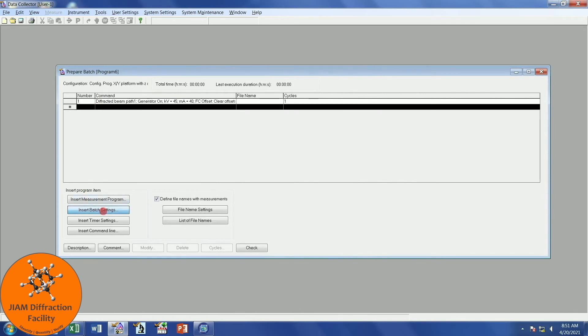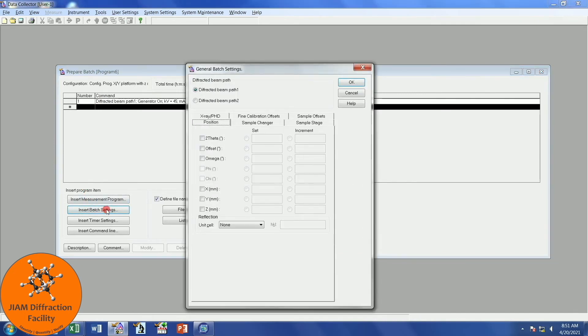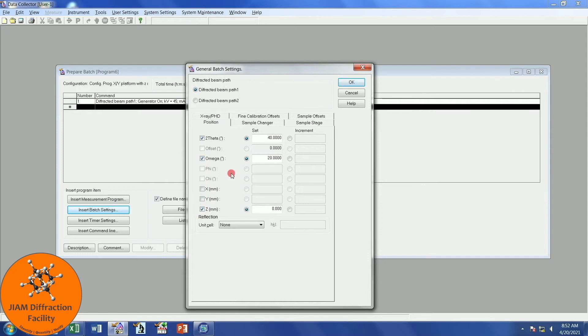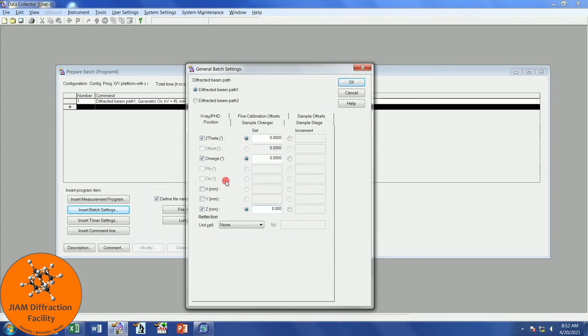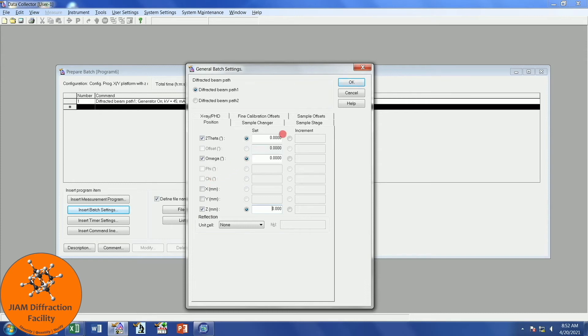We now want to insert another batch setting. This time, we want to be under the Position tab, and I will check 2 theta, omega, and z. This is for the XYZ stage. I will change this to 0 and this to 0. There are different types of stages and different situations where maybe you want to zero x and y or phi and chi. I will let you determine that. If you have any questions, please leave them in the comment section below, and let me know what sample stage you have so that we can discuss it and figure out what would work best for you. But I will click OK.